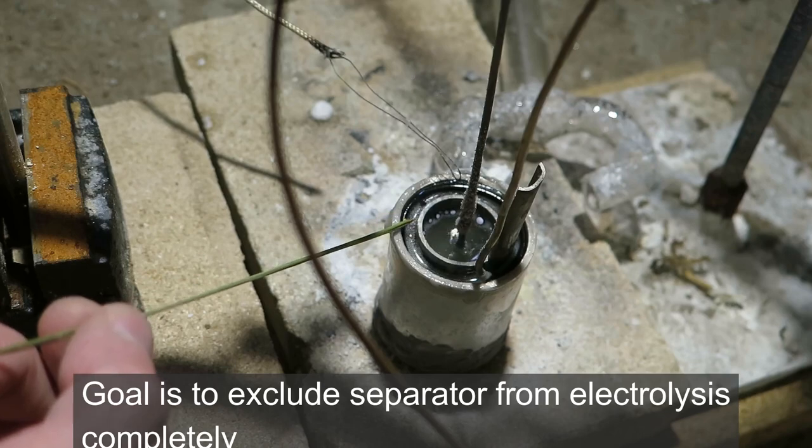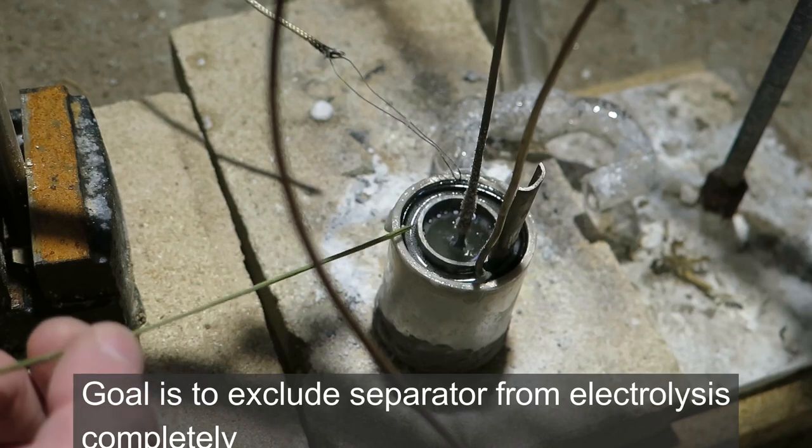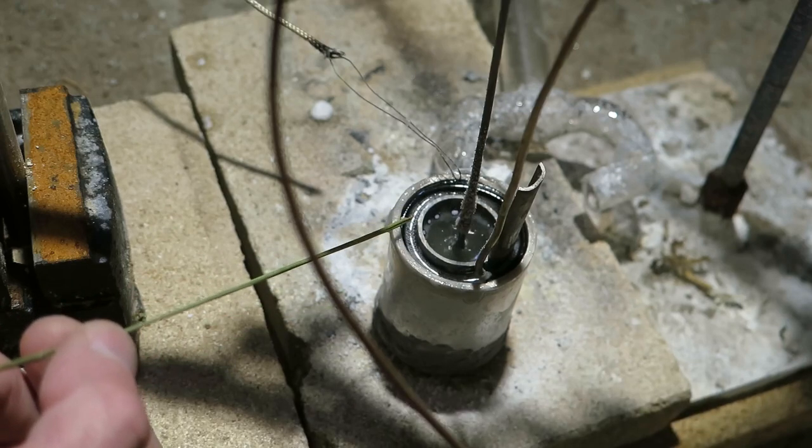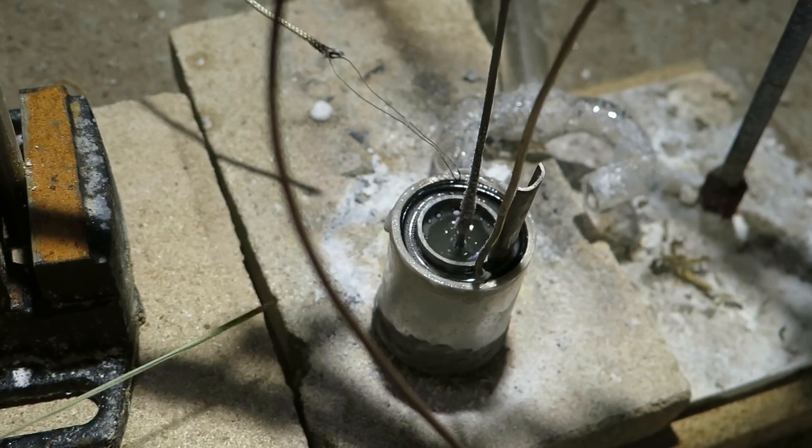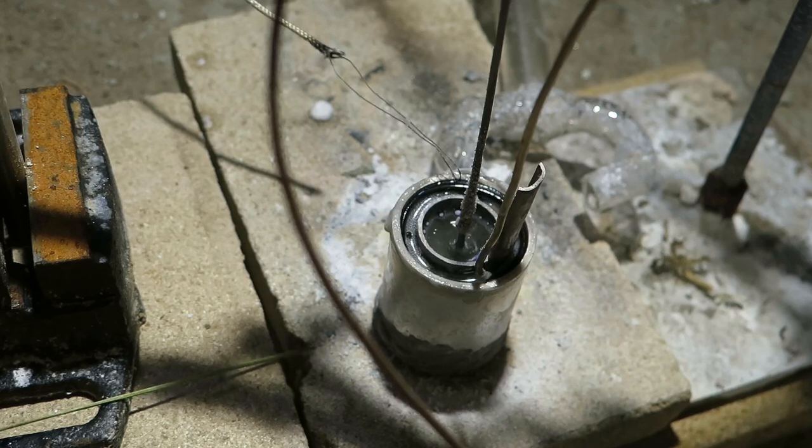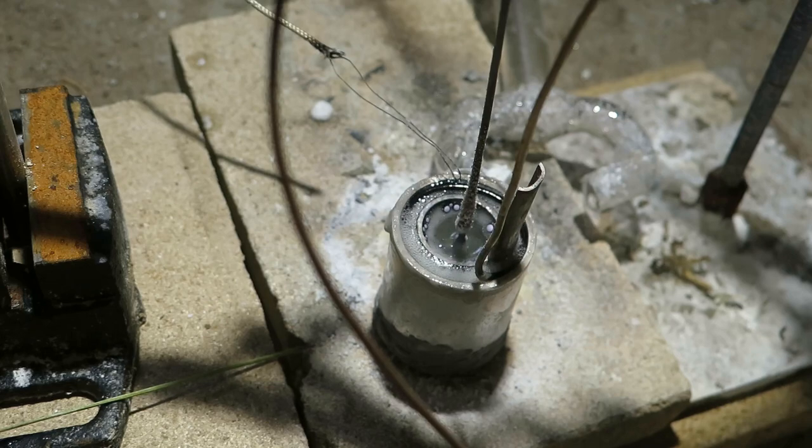Well, anyway, you can see bubbling in the outer shell of the aluminum. So that's what I'm looking for basically, and that seems to work. Now the temperature is dropping, so let's increase current significantly. Okay, here we go—20 amps.